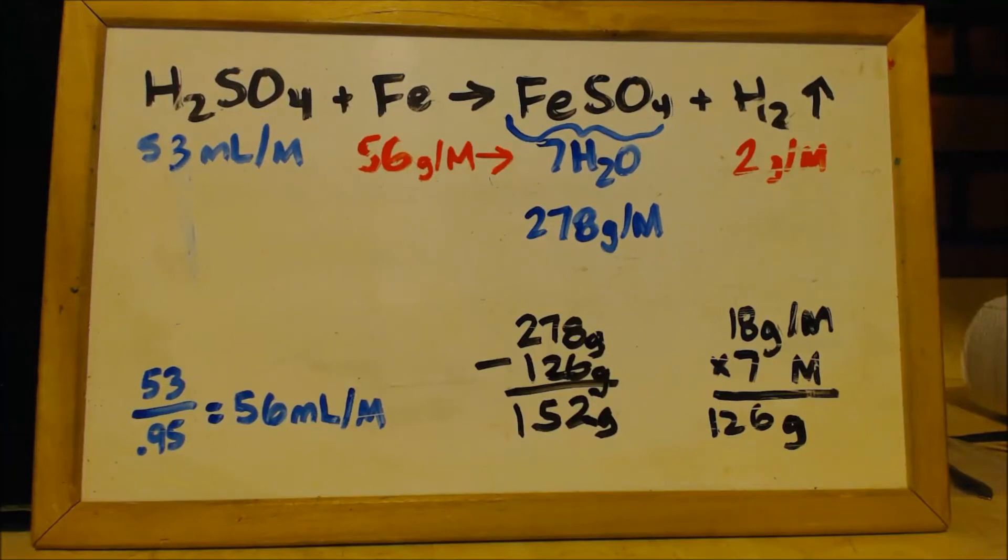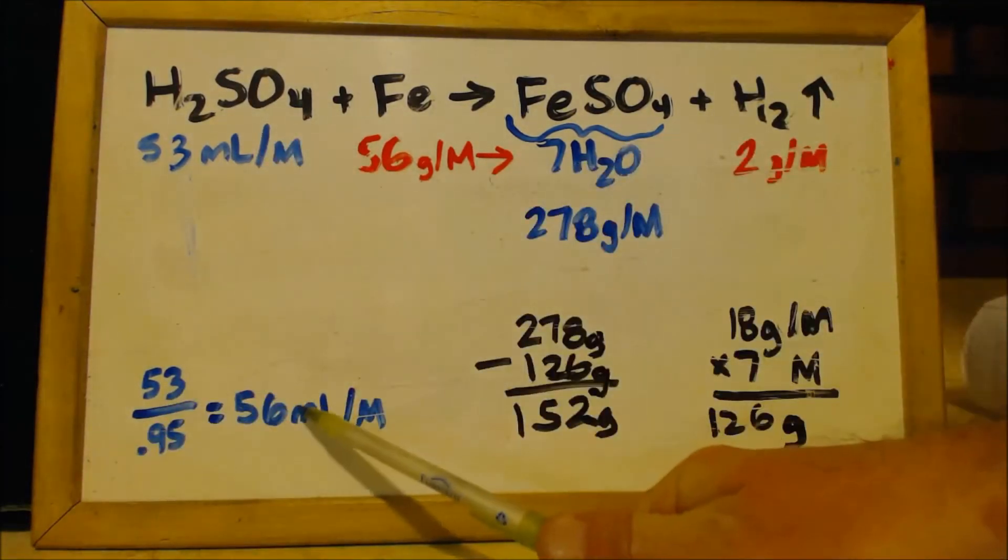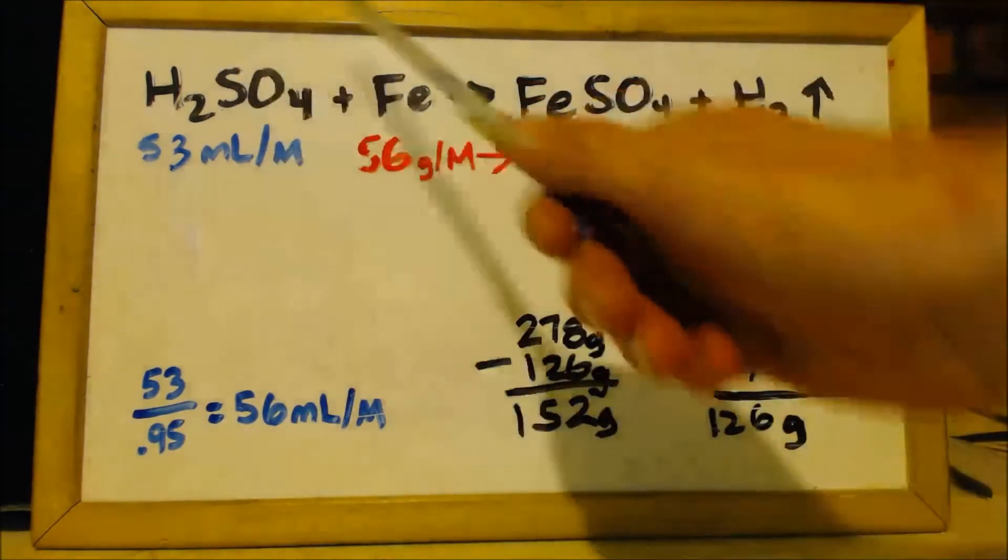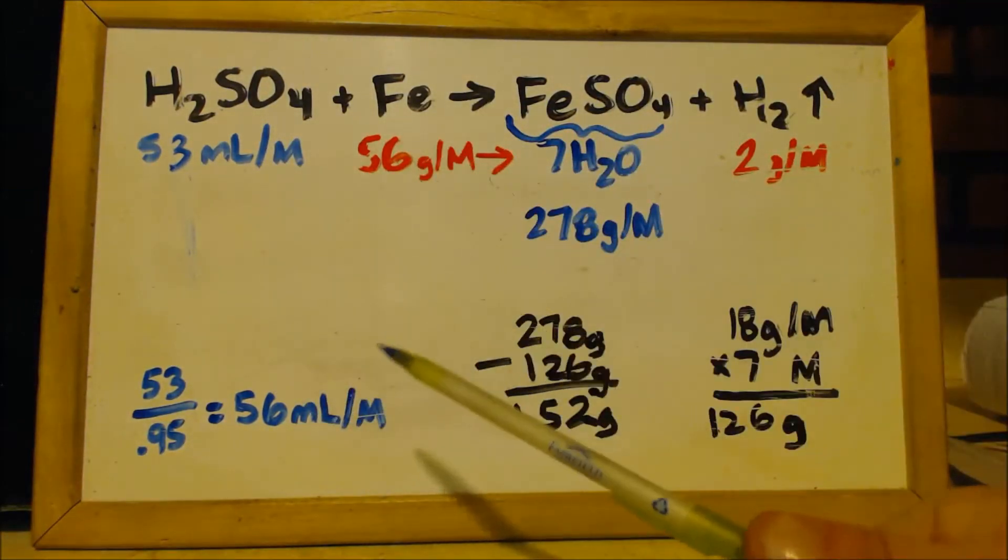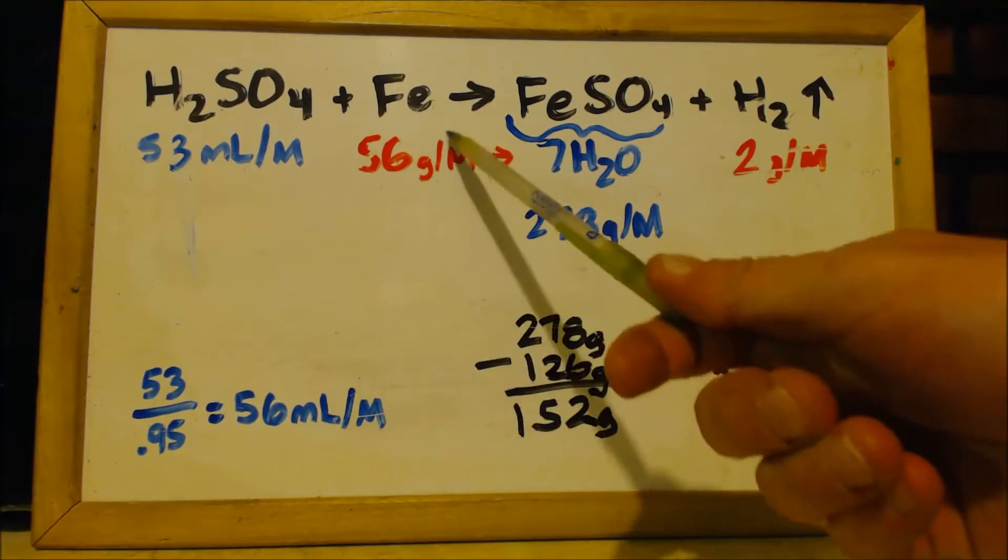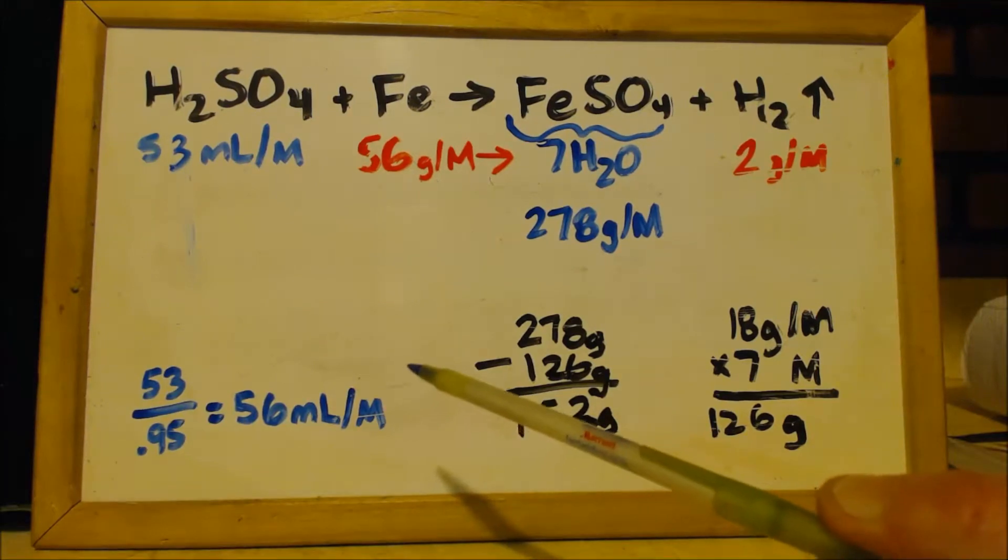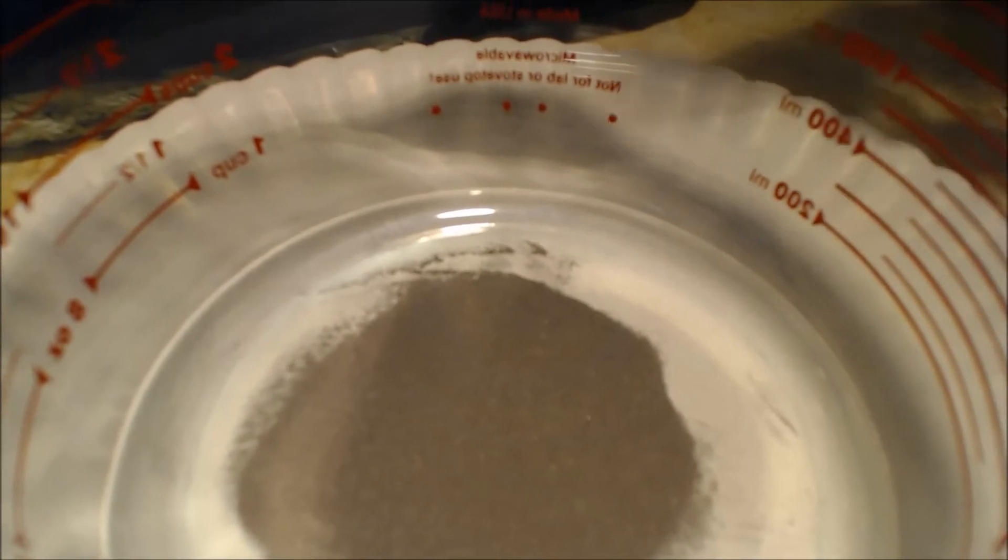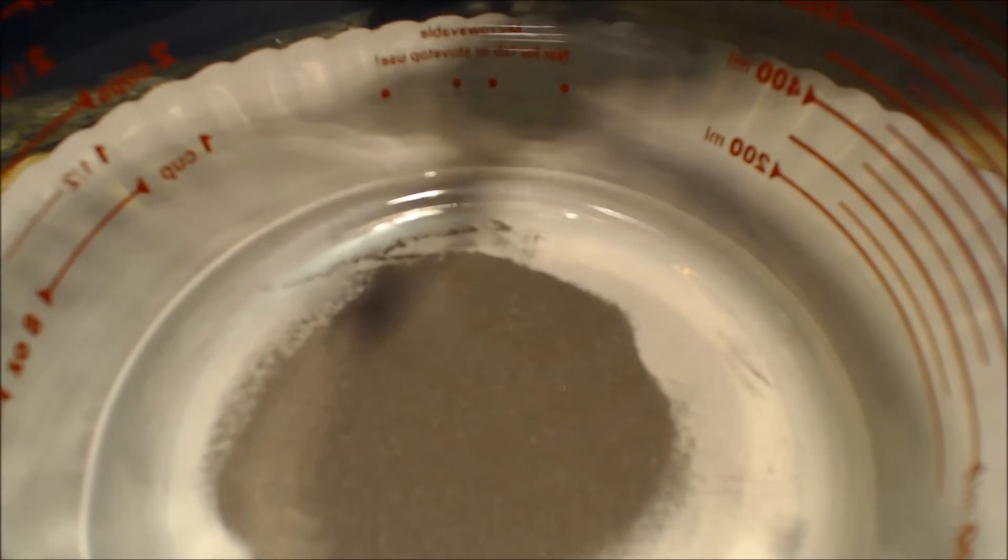All right, I want you to recognize two things. One is if you've got 95% sulfuric acid, the milliliters are exactly what the grams are of these two things you need. So it's easy to do the math if you want one. It's that simple to do the stoichiometry. Now I've got five grams of iron in there and I've got five milliliters of sulfuric acid concentrated. I'm going to just pour it in there and see what it does.